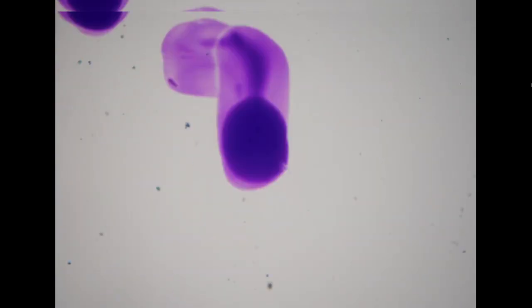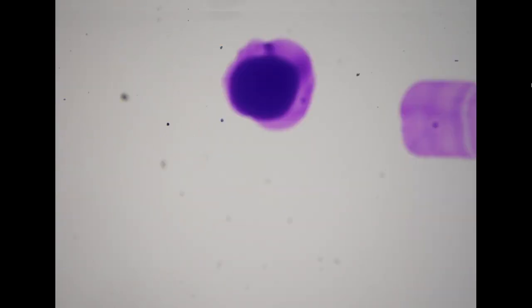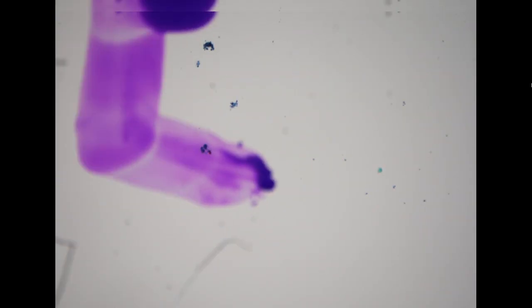So the clinician went ahead to do the ureteroscope. In the bladder, they did not see a lesion, but in the ureter, they did see some papillary lesion. So this is the washing cytology from the patient's left ureter just last week. So we received the second specimen from this patient.